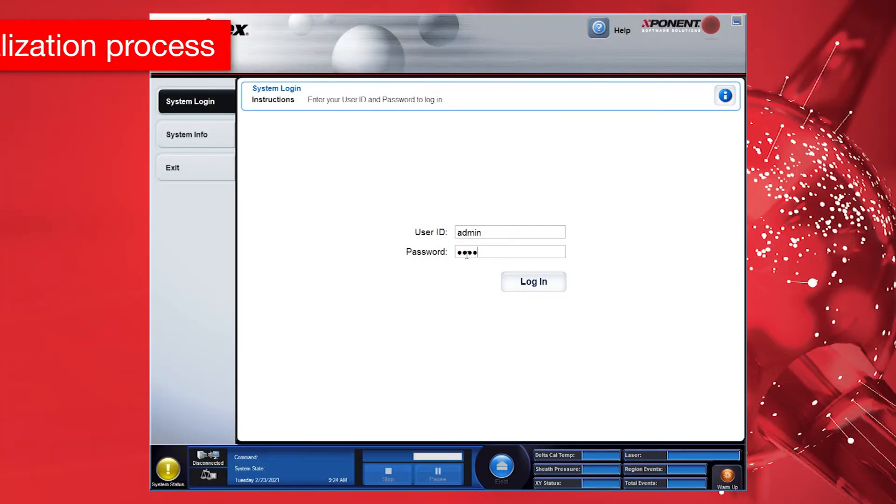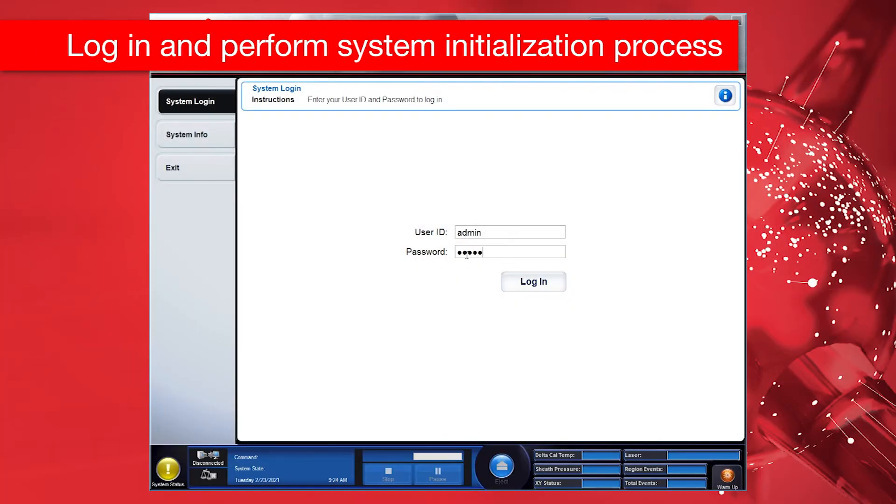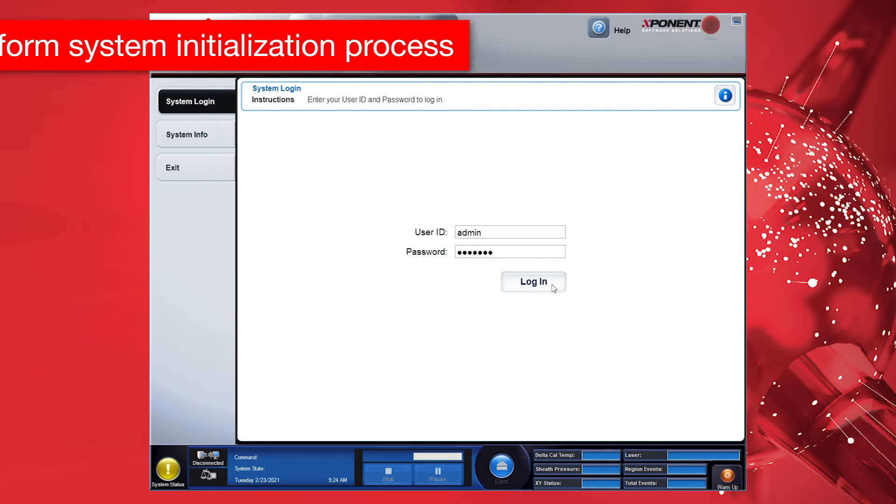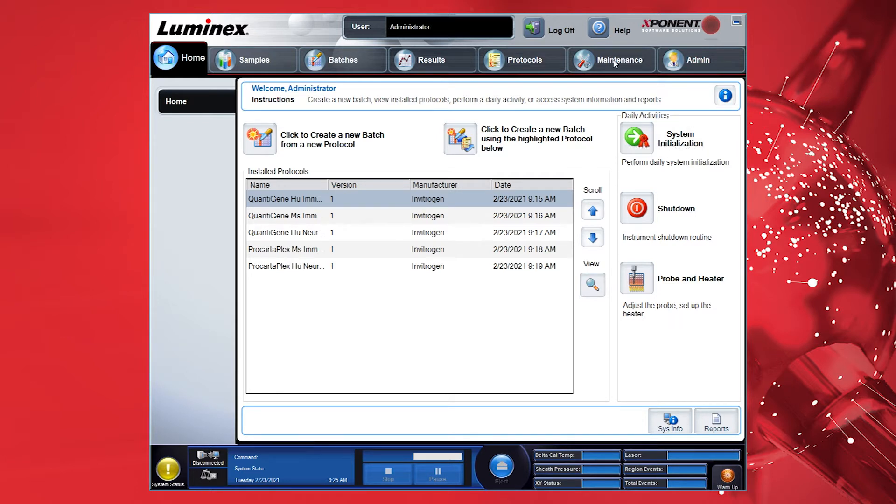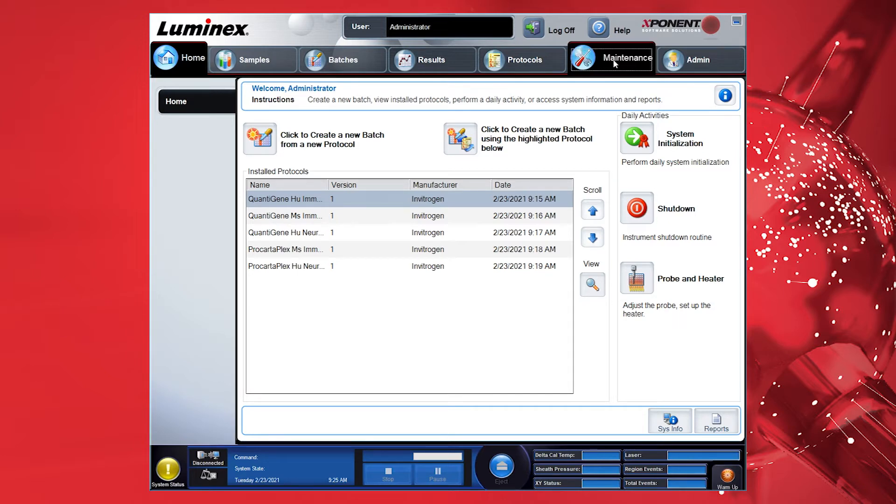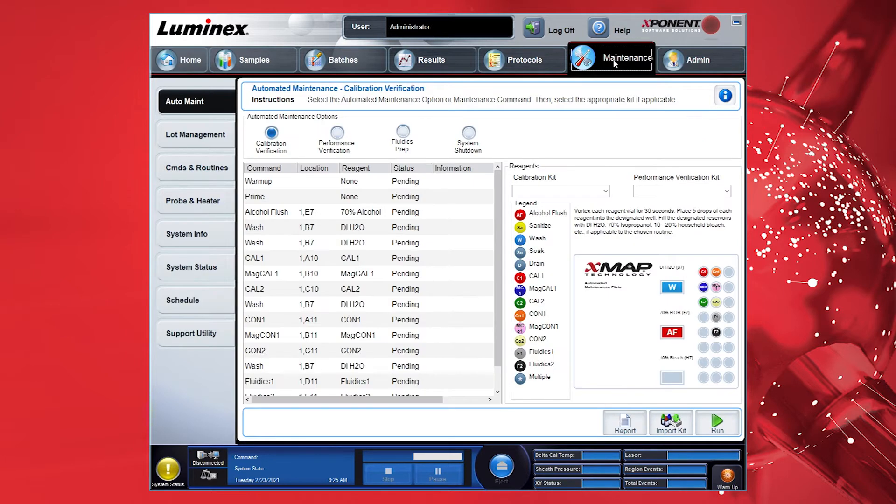To begin, refer to the LX200 User Guide to log in to the Exponent software. Start the Luminex Exponent Program from the Start Menu or the Desktop Shortcut. At the System Login screen, log in using the login instructions provided in the Instrument User Guide.